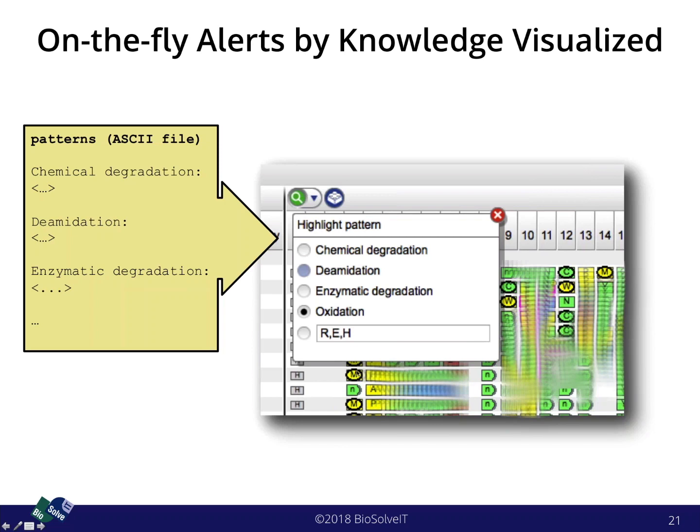And while I talk about these, I should mention that here on the right-hand side, you see a small letter as opposed to a capital letter, and there is kind of a D-shaped form around this letter, which tells you that this is a dexter, a D, a right-turning amino acid here actually.